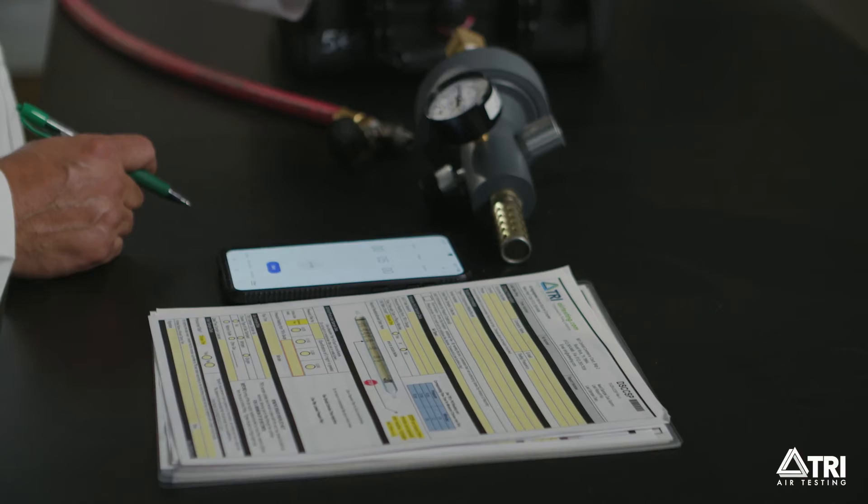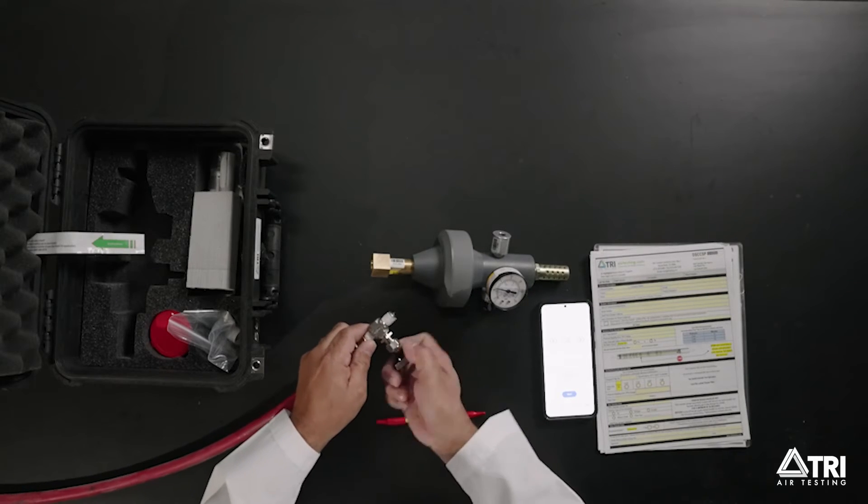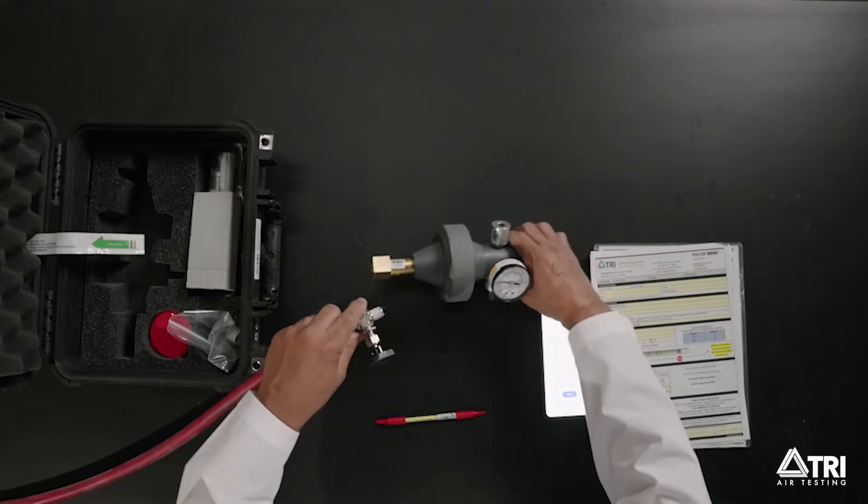On the additional information line on the datasheet, record the port location. Close the valve and connect the complete unit to the air source.